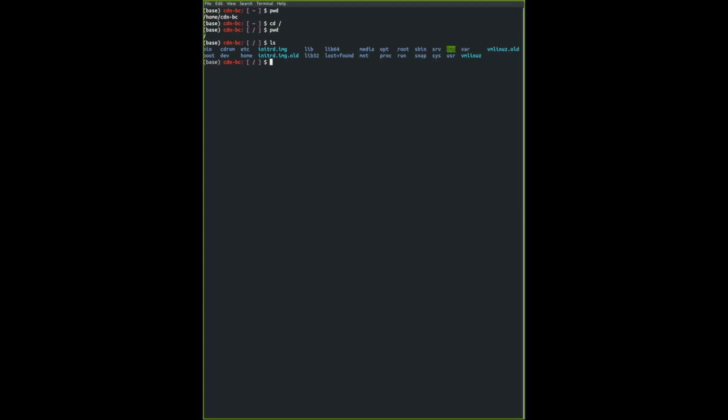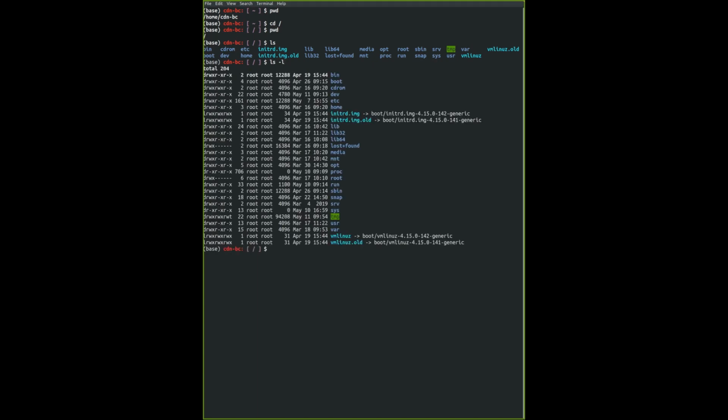We can provide flags or additional arguments to functions. For example, if I type ls with a hyphen, and immediately following that the character L, so it's -l, we can convert this to a slightly more descriptive view of the folders and files in this directory. We have slightly more information, which includes, I think, the date it was created. April, yeah, I created this about April. So this is the date that the folders and the files are made.